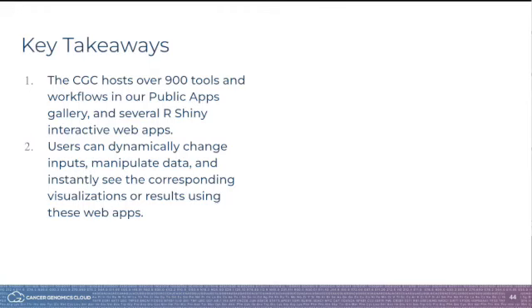Some key takeaways after watching this video. 1. The CGC hosts over 900 tools and workflows in our public apps gallery and several RShiny interactive web apps. 2. Users can dynamically change inputs, manipulate data, and instantly see the corresponding visualizations or results using these web apps.